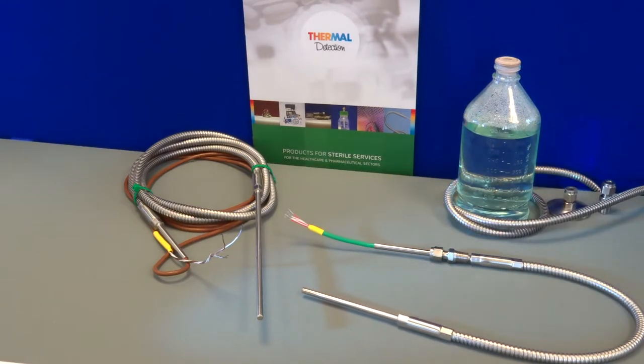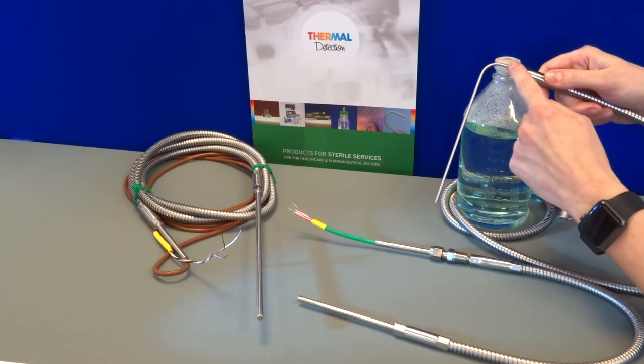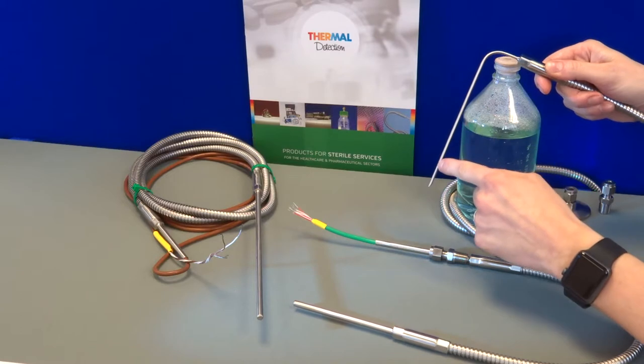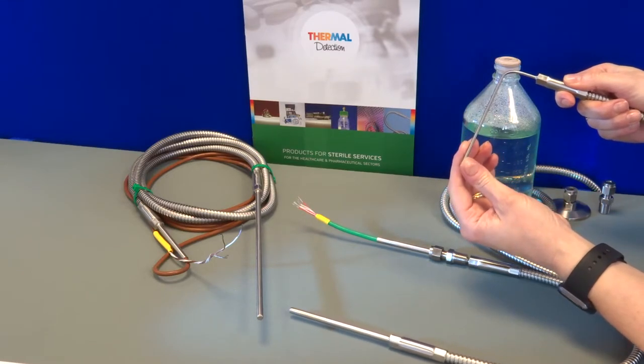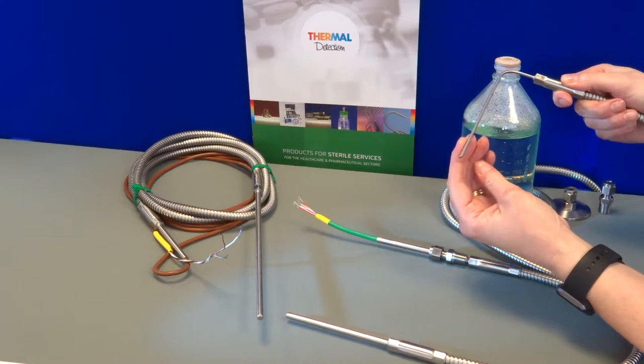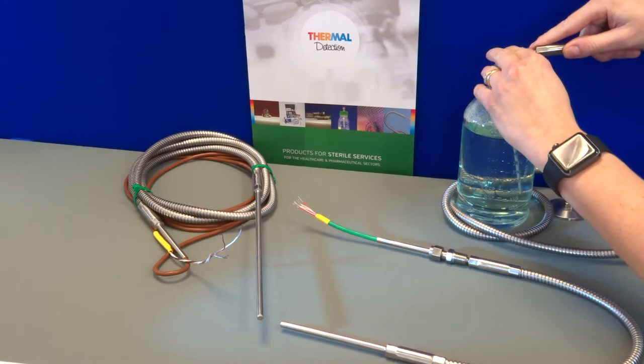Here I have an example of another probe which we manufacture for a customer, which is 3mm in diameter, has a 90 degree bend, and also a chisel point at the tip. The reason for the chisel point is so that it makes it easy to push into rubber stoppers in bottles.